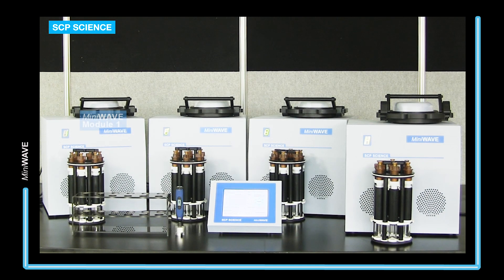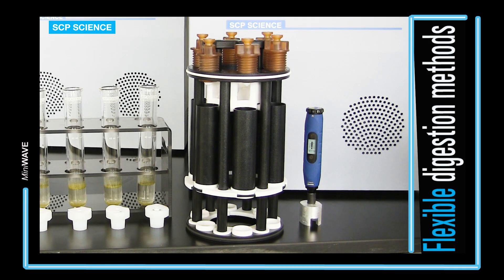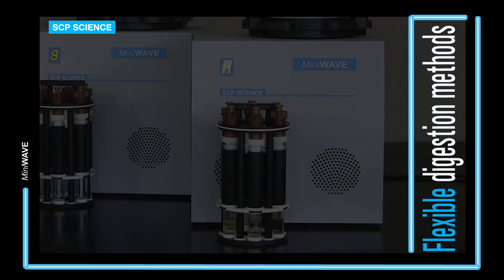The MiniWave consists of a touchscreen controller and up to four digestion modules connected via USB cables. Each module is able to digest up to six samples simultaneously in quartz or Teflon vessels. Each module can be programmed with a separate digestion method or with the same digestion method.